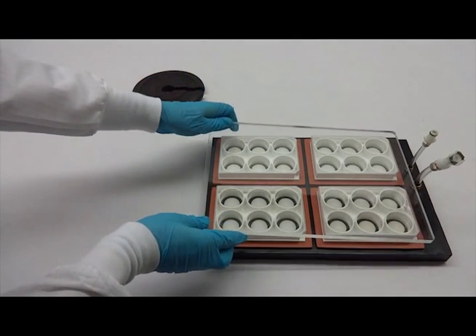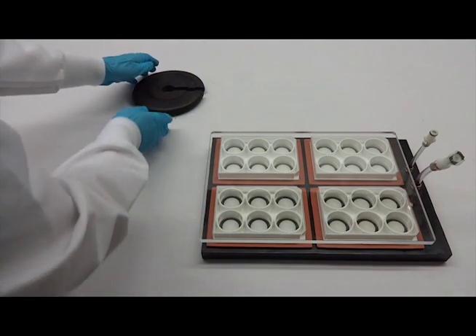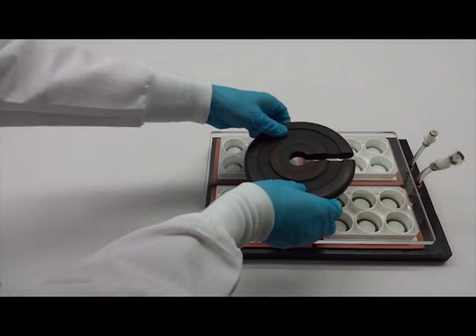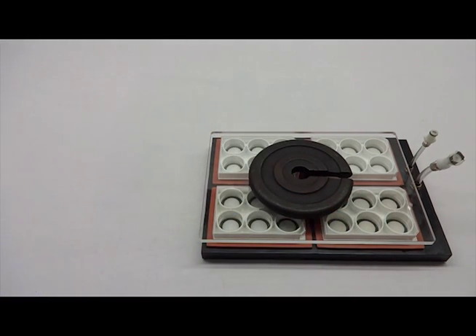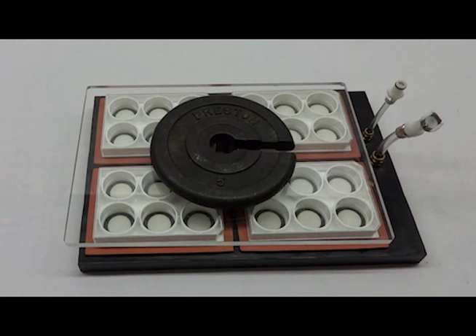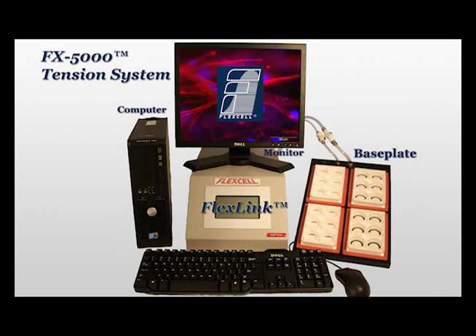place the clear acrylic window over the culture plates. If needed, five to ten pounds or 2.3 to 4.5 kilograms of additional weight may be placed over the window to help seal the base plate. Your tension base plate is now ready for use.